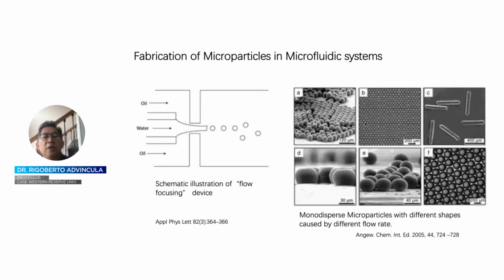are produced. So what is represented by oil and water simply means that the oil can have a resin or a monomer and an initiator that can be initiated to produce particles, which are then individually isolated, as shown here with very good monodispersity. And the size, the rate of production, the degree of cross-linking or polymerization can perhaps be controlled as simply as by controlling the flow rate. And there are many examples of such value chains in particle synthesis.